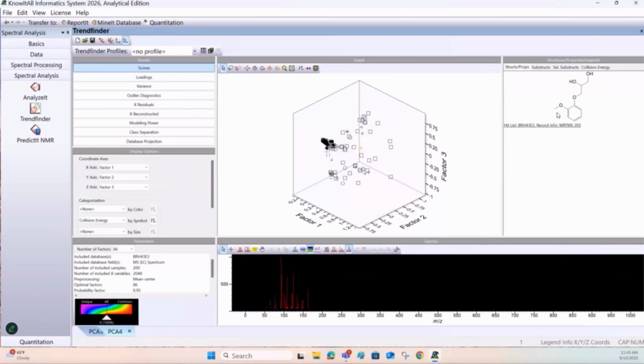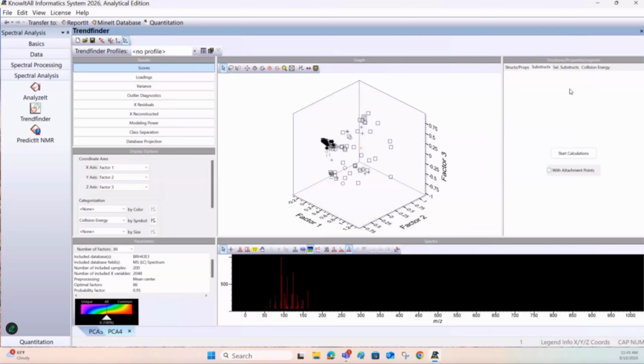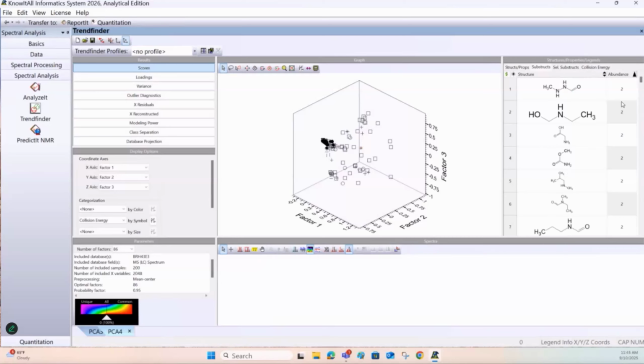Okay, we don't stop here. We did many things to make this application exploratory for users. So for this data set, 200 compounds, you can calculate what kind of substructures they contain. So it goes to the database record, analyze substructures in this data set, and you can sort by the abundance of substructures, up and down.